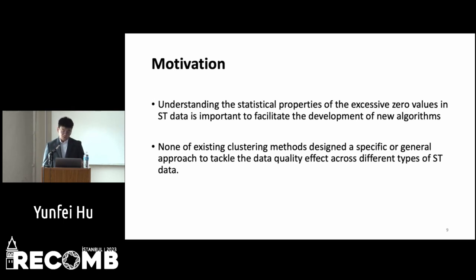None of the aforementioned existing clustering methods design a specific or general approach to tackle the data quality effect across different types of ST data. So we were thus motivated to develop a robust clustering algorithm to deal with this kind of problem.